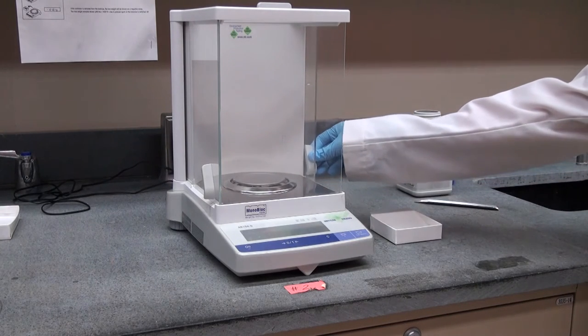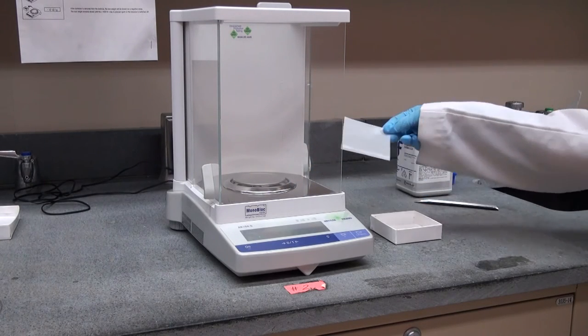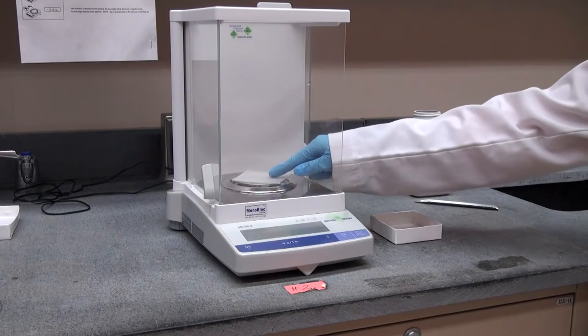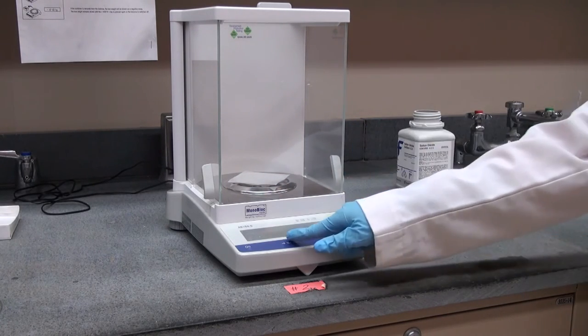You can access the balance pan by opening a drawer, and you can put in this case a piece of weighing paper. We would tare it by closing the door first and then taring the balance to set it to zero.